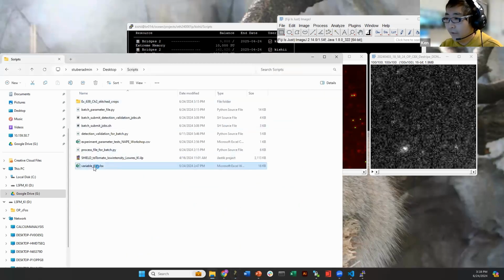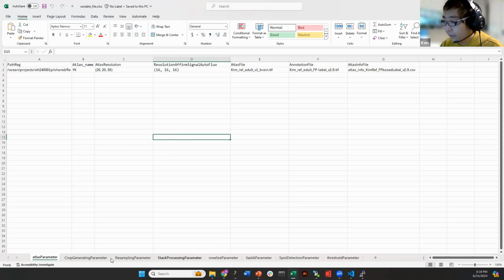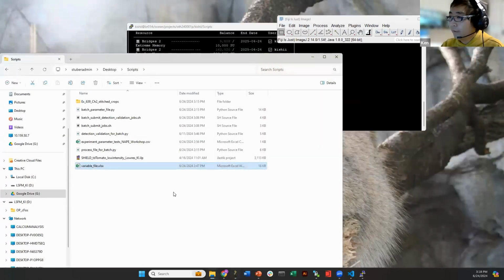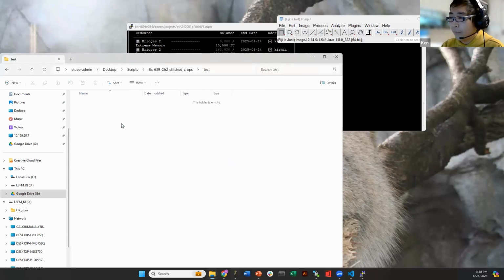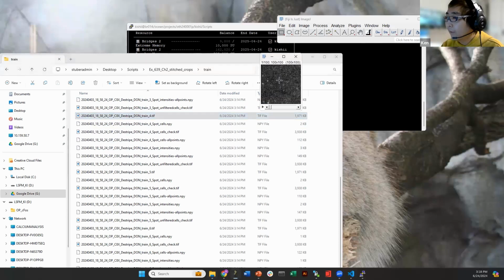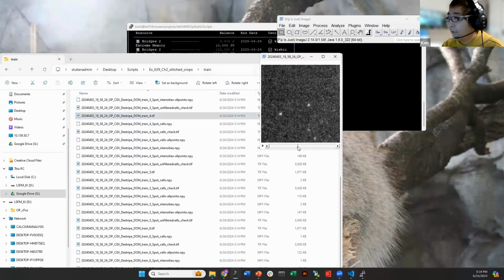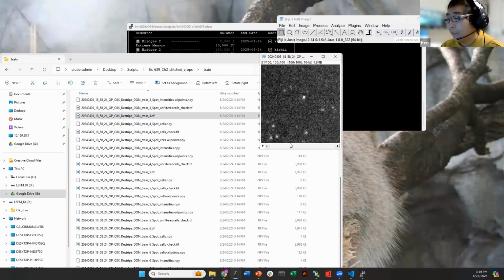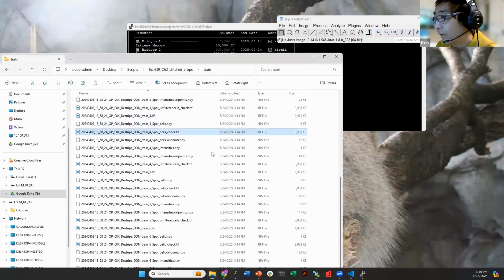So in another sense, you go to the variable files, and then you can go to the threshold parameter. So you can adjust this to make it work. Okay. So the cropping will not be perfect, and you don't necessarily have a lot of good cells in there. But yeah, you will have enough. You will get a bunch of crops that should have some good cells in it, and then determine whether the cell detection algorithm worked well by looking into the cells checked file here.